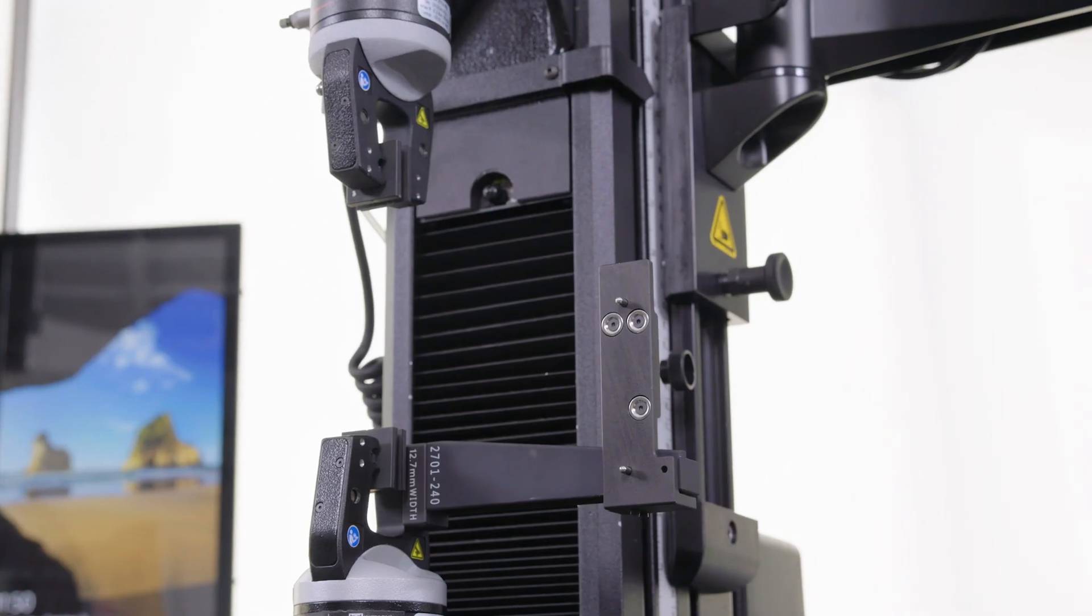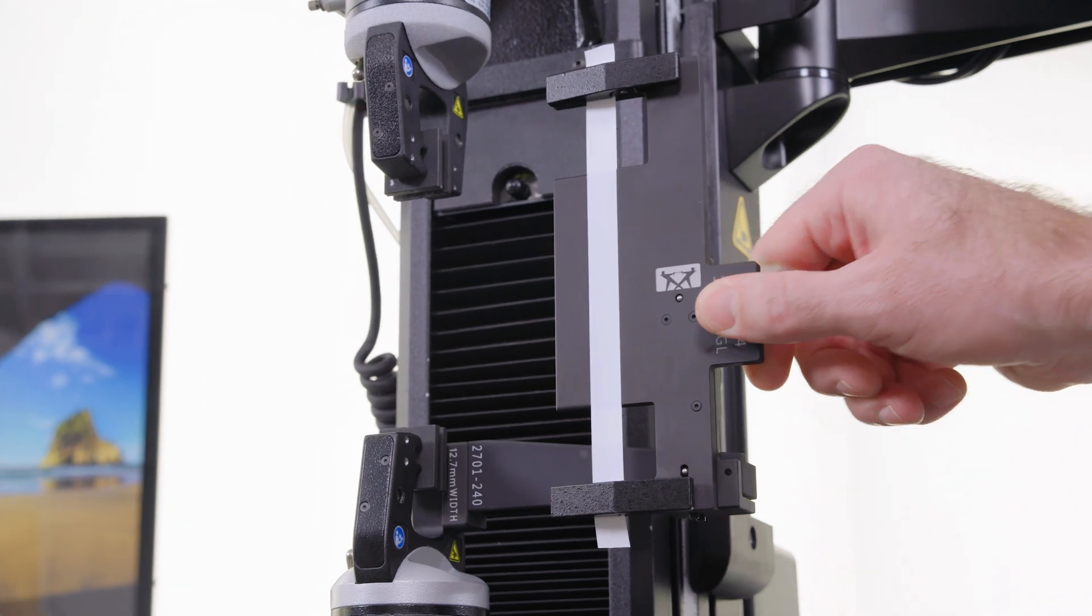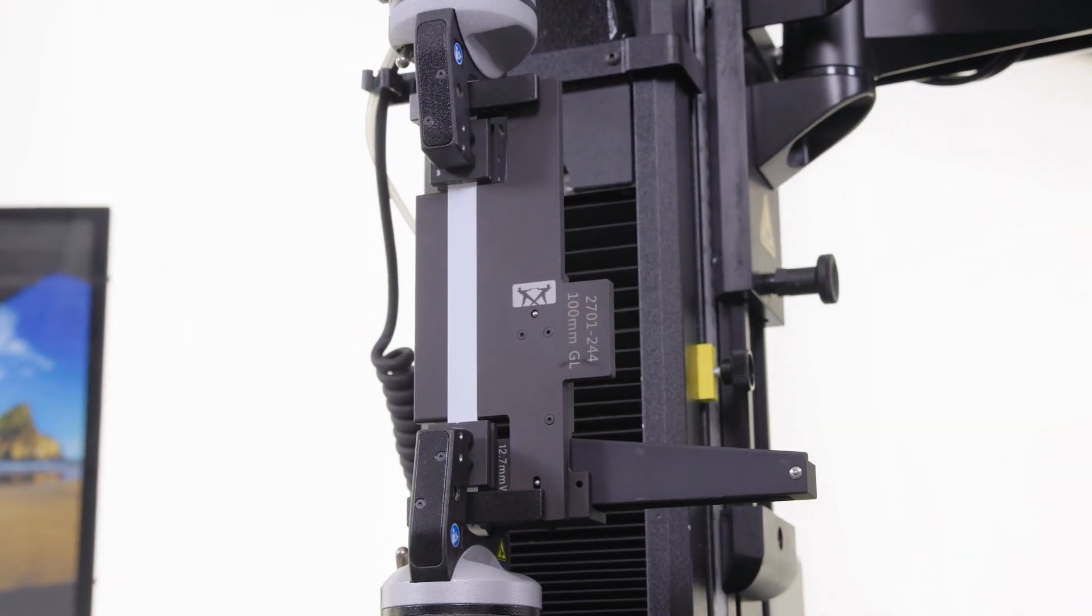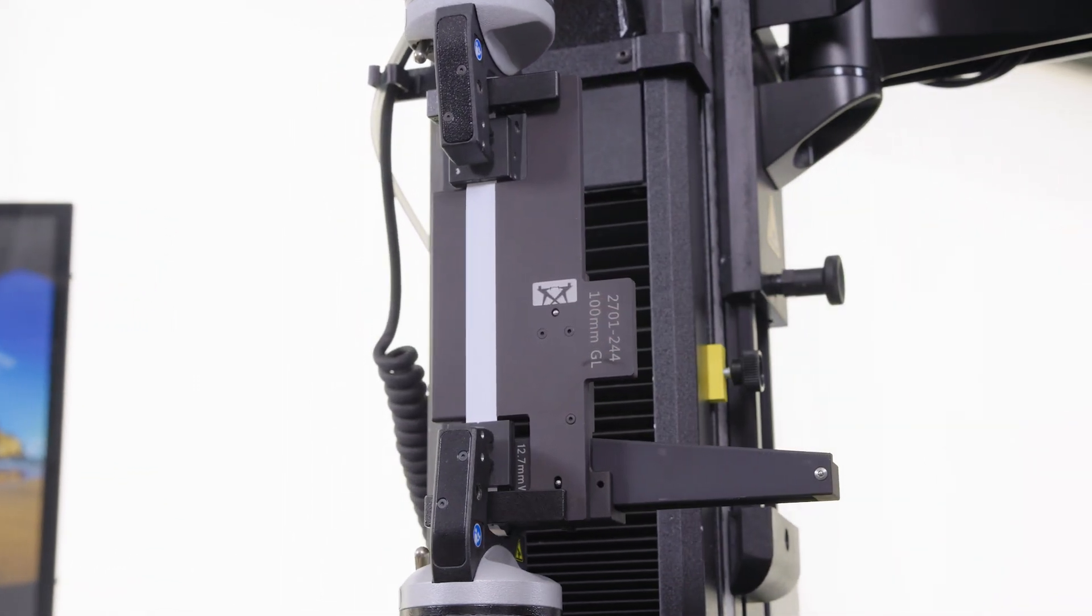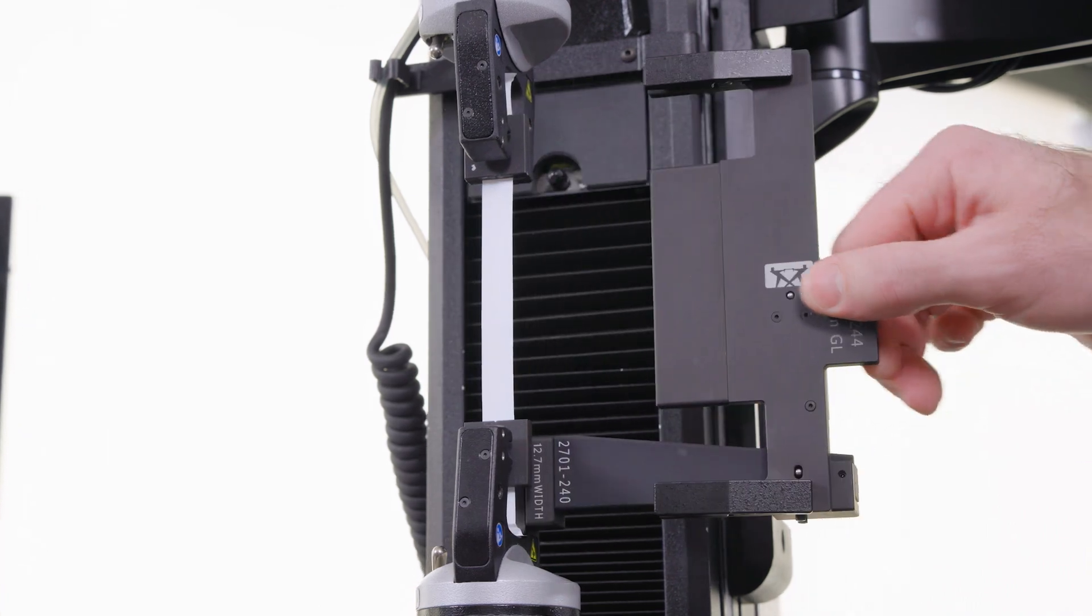So we put our engineers to work on developing this precision specimen loader for pneumatic grips, which makes it easier to load and properly align these types of delicate specimens.